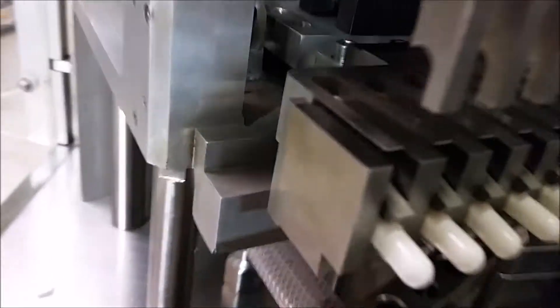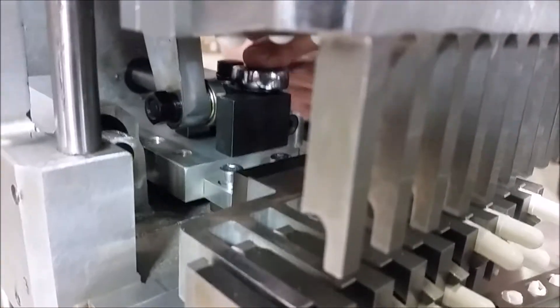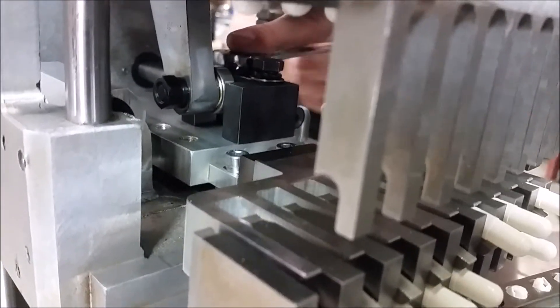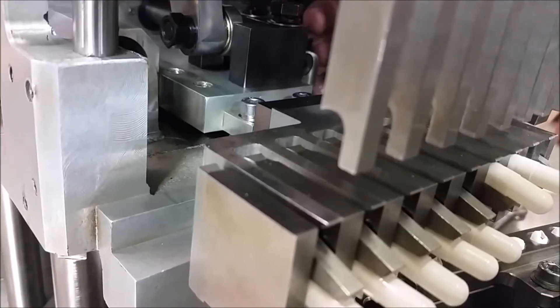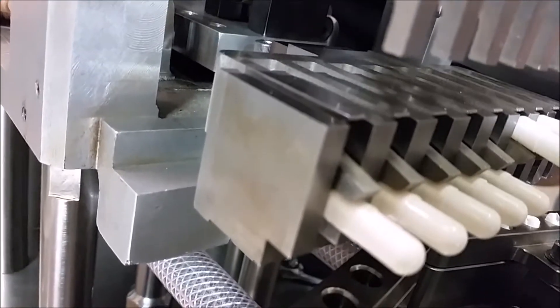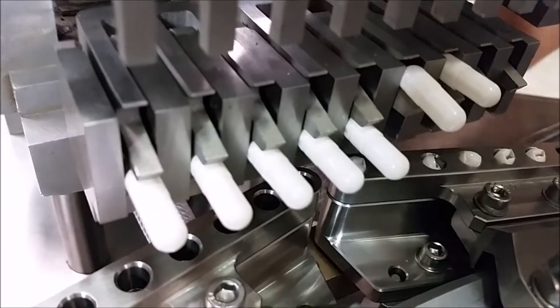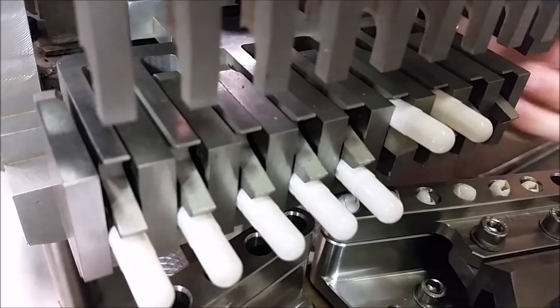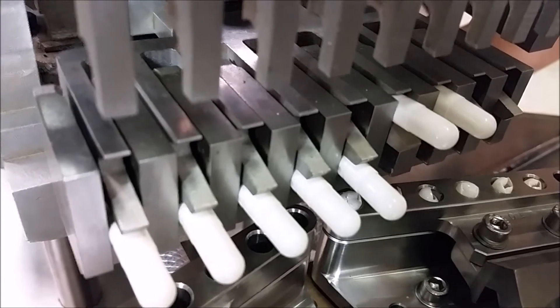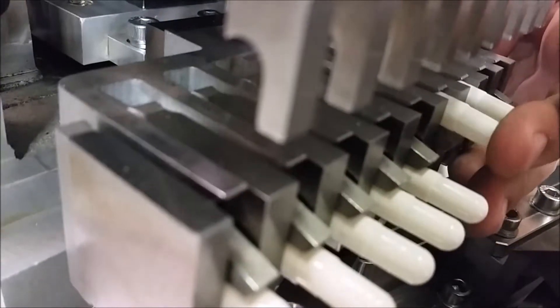Come back behind both sets of forks and loosen these. Then make the adjustment as to where they need to be. If you push it too far out, you can just push the cap back until it's where the fork is, so you know if you're out too far or not. Once it looks good, tighten things back down and move on to your next step.